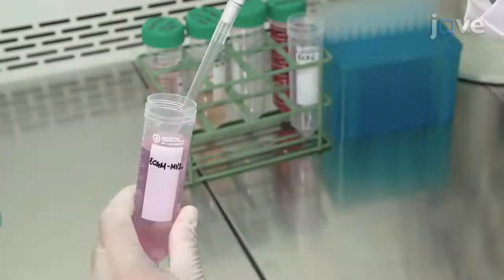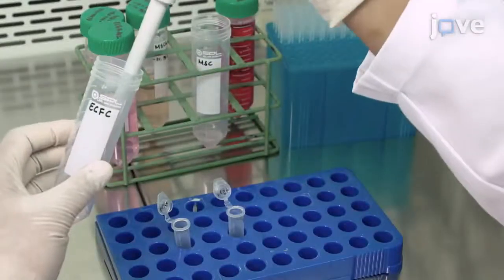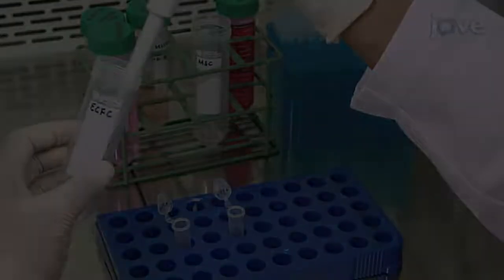After the second wash, dilute the ECFCs to a 3 times 10 to the 6 cells per milliliter of medium concentration, and the MSCs to a 2 times 10 to the 6 cells per milliliter of medium concentration.